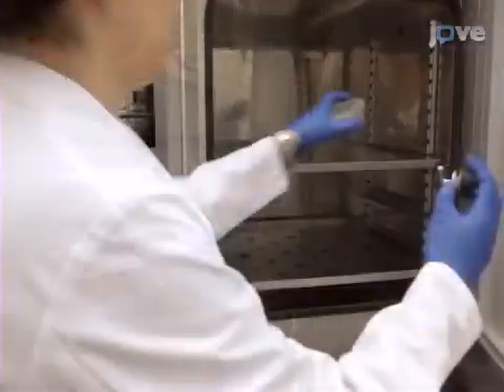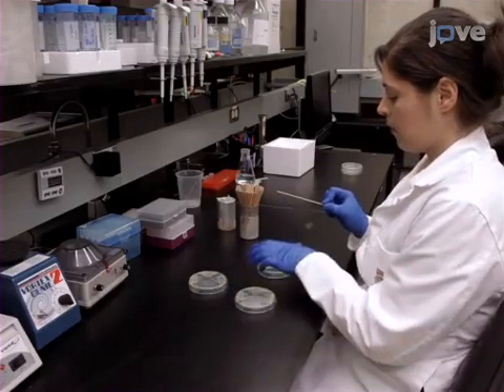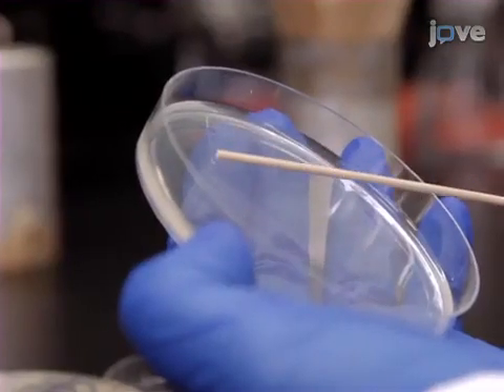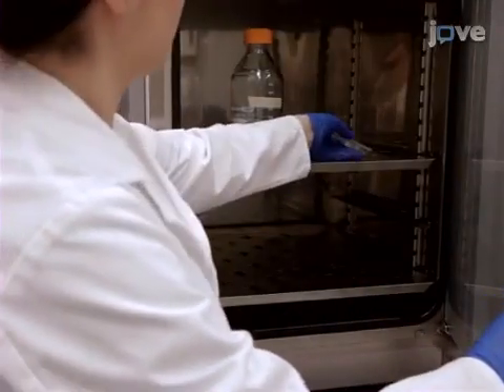On the day before PCR is to be done, select a single colony of MRSA from a fresh overnight plate with a sterile culture stick and prepare a heavy streak of the bacteria on a tryptic soy agar plate. Multiple samples can be streaked onto a single plate. Incubate overnight at 37 degrees Celsius.